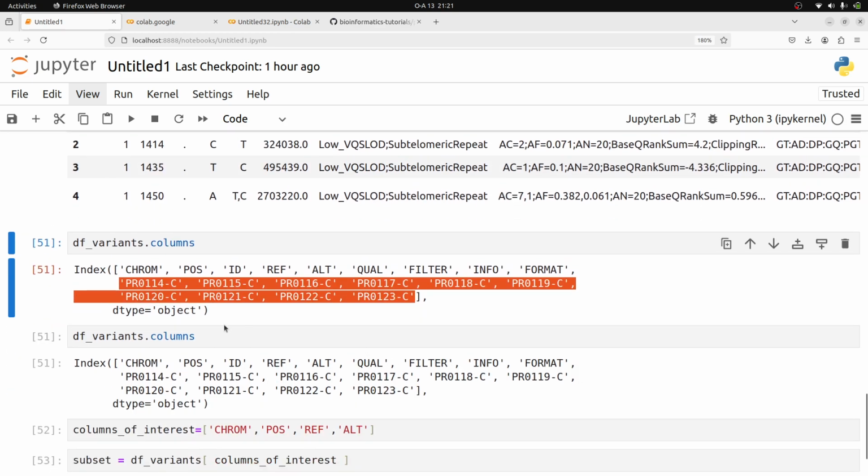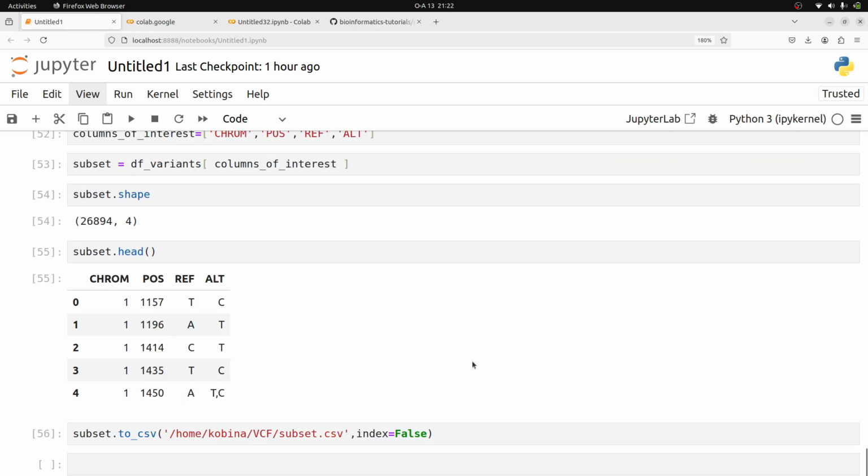But for the sample-specific variants, we have to do additional tweaking, and you also have to use other tools like VCF tools. That is beyond the scope of this tutorial, so I'll try to make another tutorial on that, and I'll share it once it is ready.